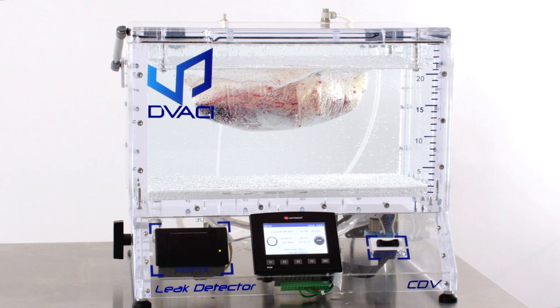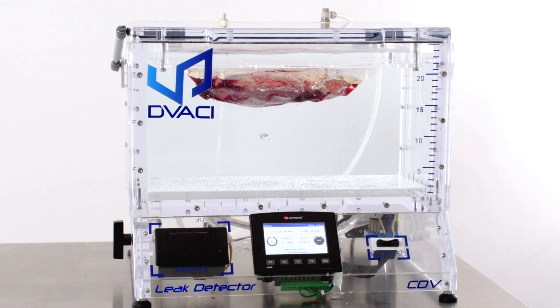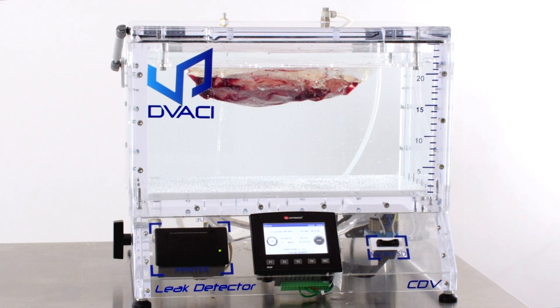As we apply vacuum, the package starts to swell up because of the difference in pressure outside. In this case, there has been no leak from this package, so it passed.